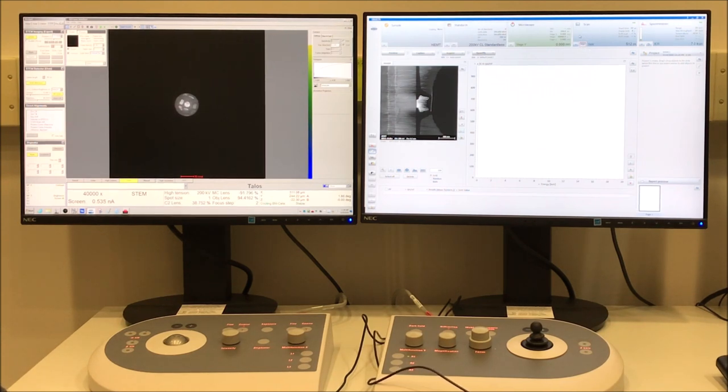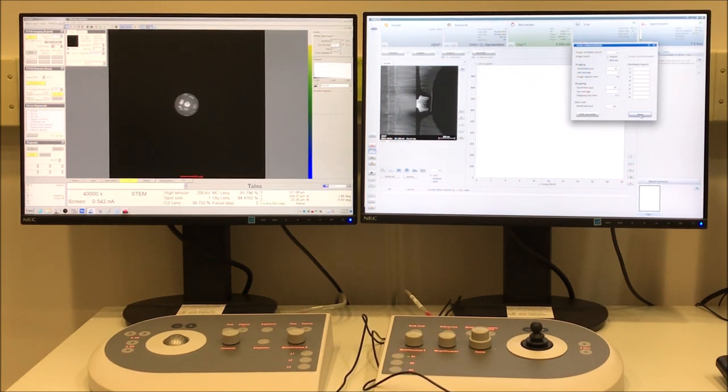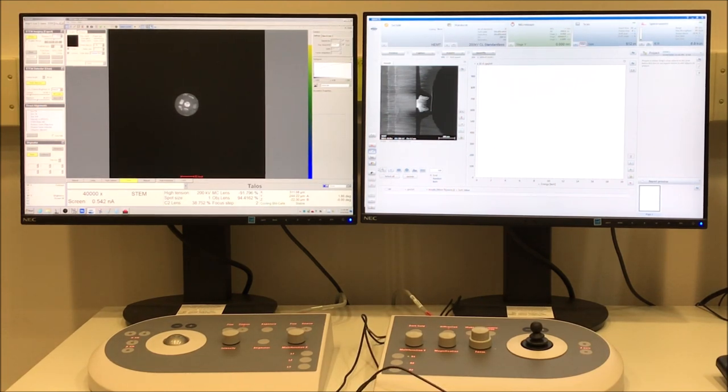And now under the STEM image, you see these different shapes. Those are the different ways you can collect points. So you can do individual points. You can draw boxes, you can draw ovals slash circles, and you can also draw polygons here. Then select all. If you push that downward facing button on acquire, you can configure how you want the acquisition to go. Just to save time, I'm going to set it to acquire for 15 live seconds for each of those analyses points, and then I'll select acquire. So it will do these in the order that you drew them.